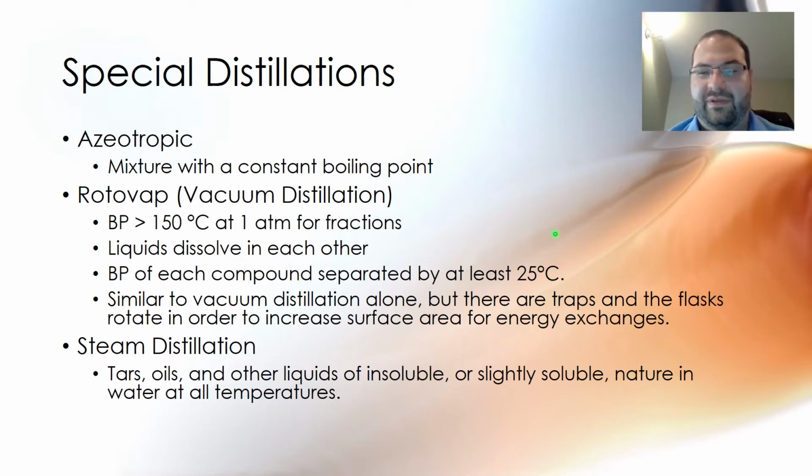And your macro scale kit, and probably your micro scale kit too, has all of the things you would need to do it. You have an inlet, and on that inlet in your macro scale kit, I mentioned to several of you that that was a vacuum adapter, and that's exactly what it's for. You can hook flasks up to the distillation apparatus, leave the inlet in. You can actually put an ice bath underneath the flask that you're collecting your product in to keep it cold, so that it doesn't go back up into the system and you don't have any insensible losses in the system.